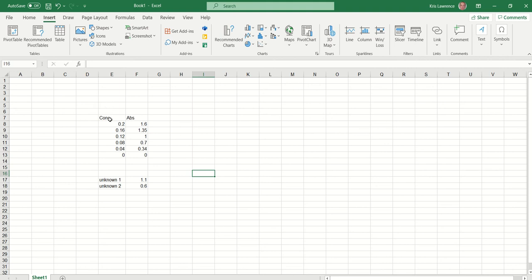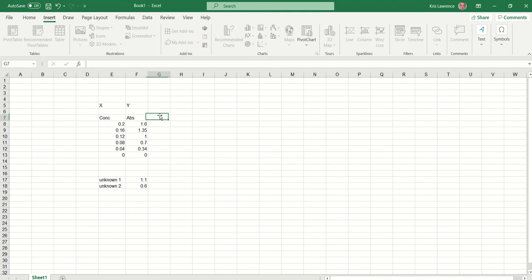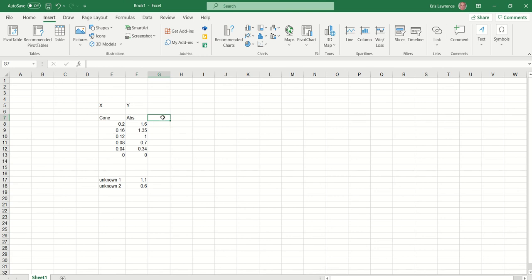What I've got here is the data from the previous video. The way to lay it out is your X then Y — a 'run before you jump' style format you'll have been told at school. So I've got my concentration and my absorbance values. All we're going to do is select the data.